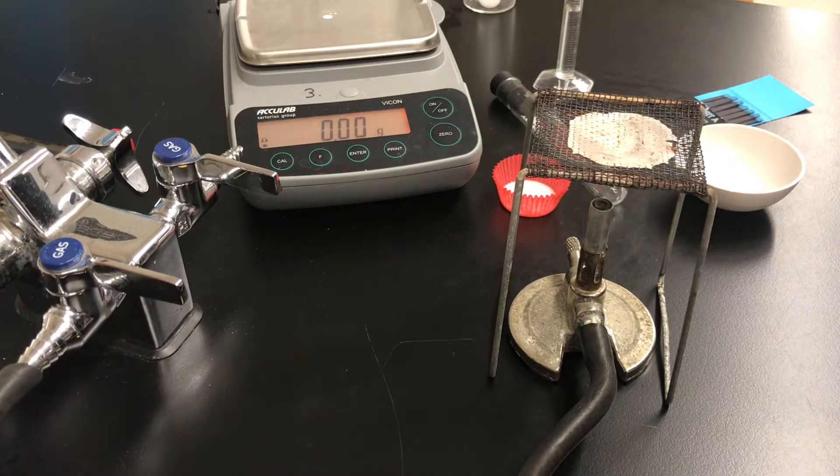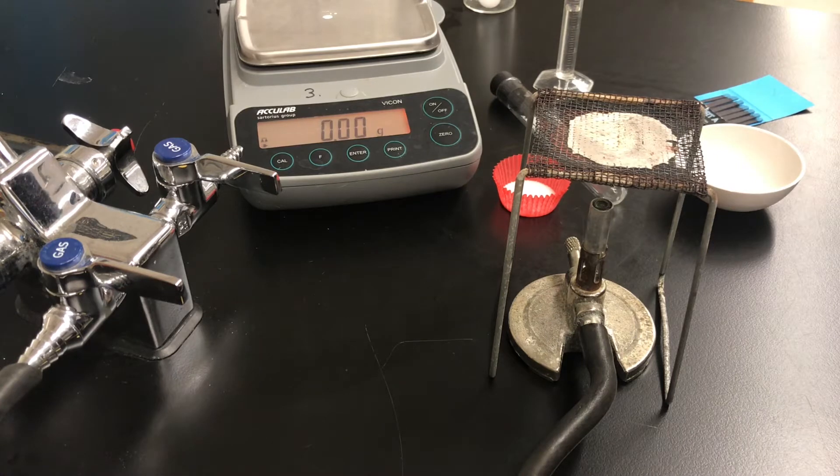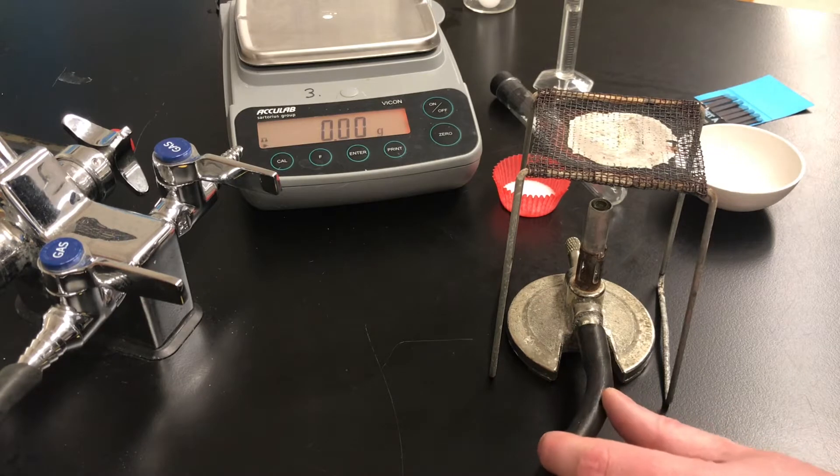In this video we're going to take a look at the experiment called concentration of a saturated solution for grade 9 advanced science. This is in your science booklets in unit 3 on solubility.